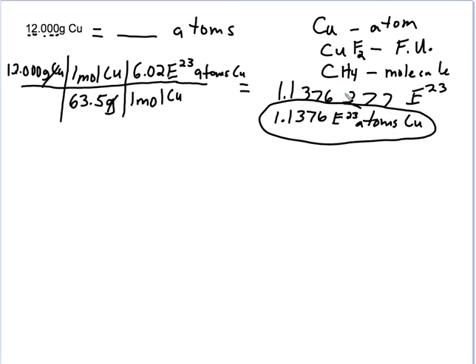Okay, now I want you to compare this one, and I'll have these calculations on the board, but you can look and compare this one, the copper one, to the next one, which will be baking soda. All right, so here's the baking soda one. It's a little bit different.